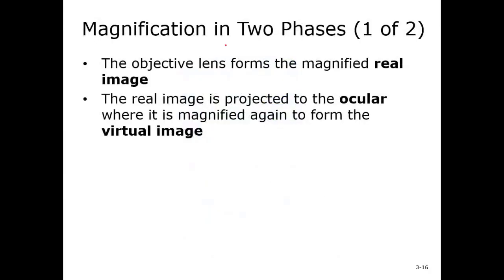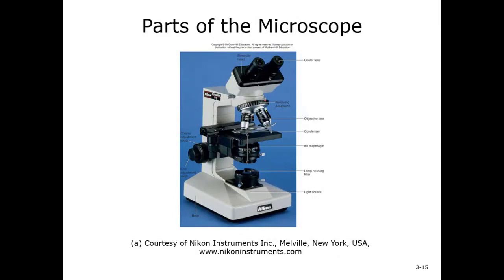As you know, when you look under the microscope, there are 2 different lenses. The part you actually look through is the ocular lens. The ones we have at home are 10x, and we also have a 15x. Most of the time in the real world, the ocular is usually 10x. And then the other lens is the objective lens. I think our microscopes at home have 3 different objective lenses. They have a 4x, 10x, and a 40x.